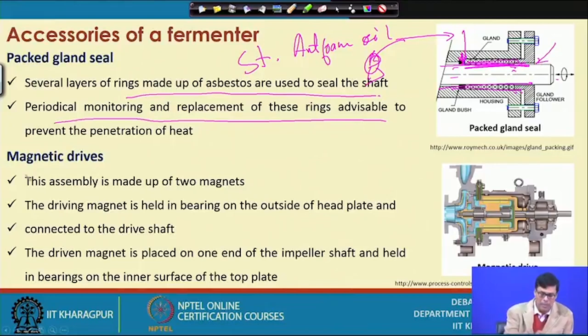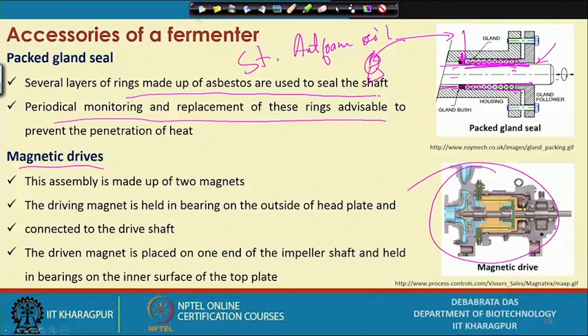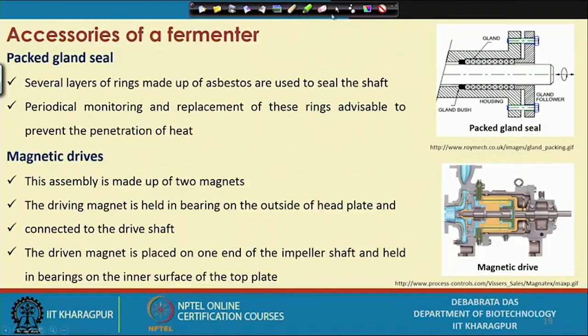That is why we use the magnetic drive. It is used to avoid any kind of contamination problem. So this is another recent development we have.